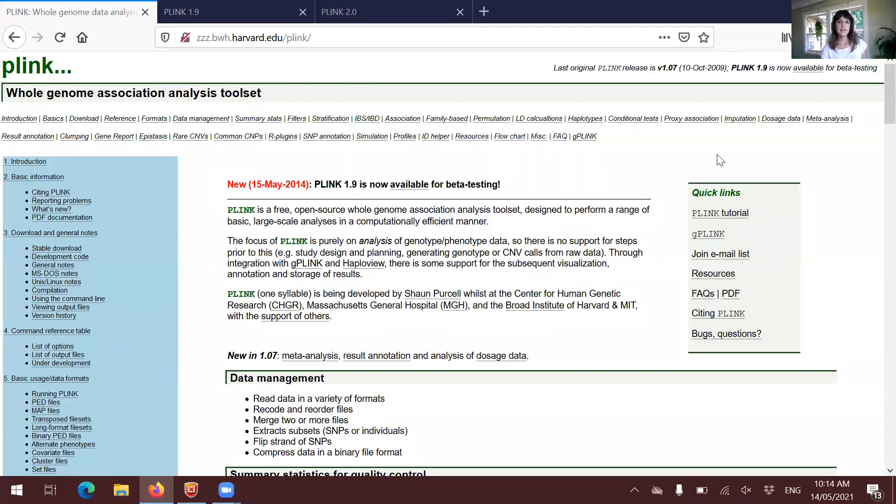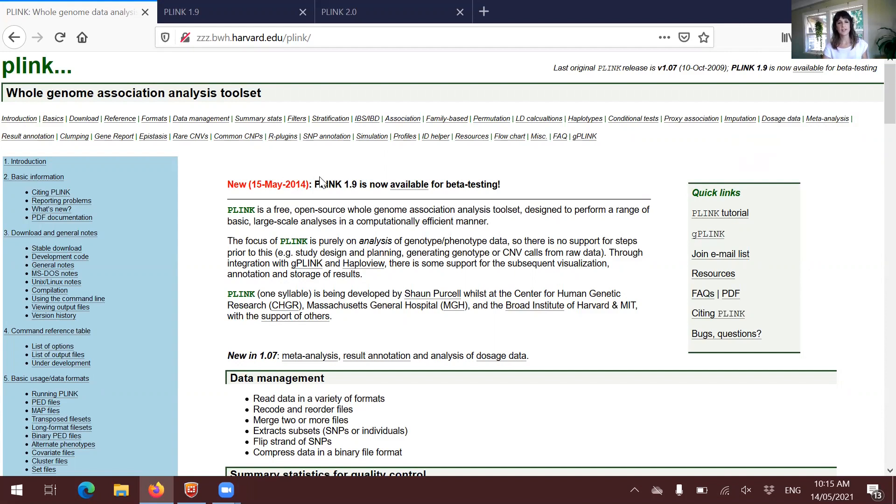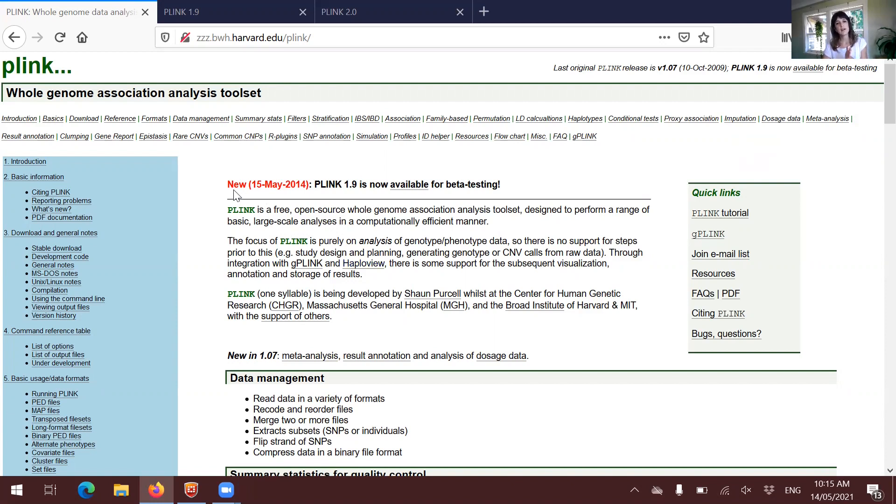So this here is the basic PLINK website. As you can see here at the top, there is a note saying that there are more versions available for beta testing. This is the basic website and it's very nice and neat. Many times, even if you are using other versions of PLINK, you may be consulting the instructions here because they are complete.